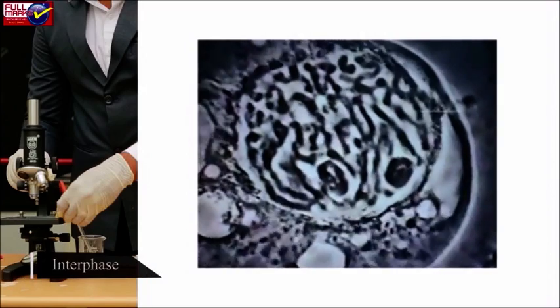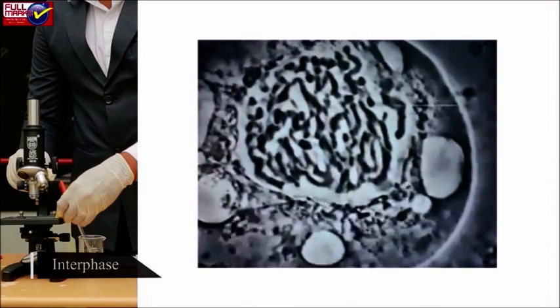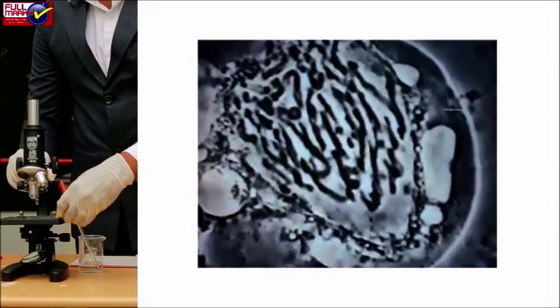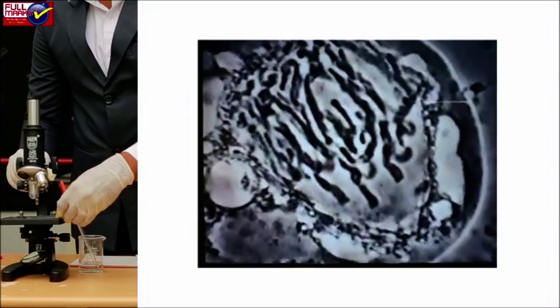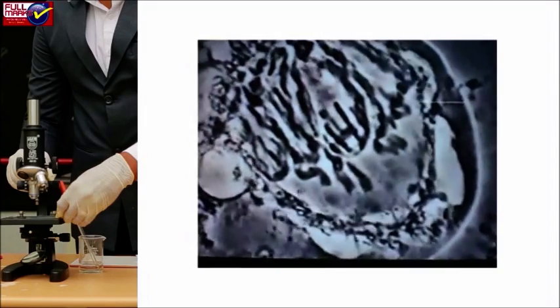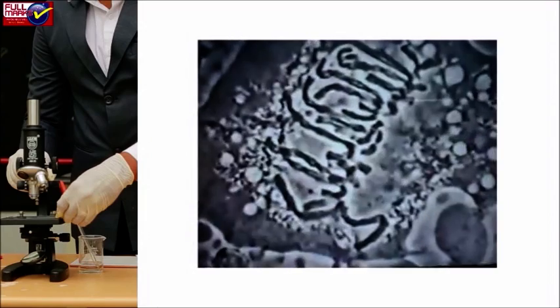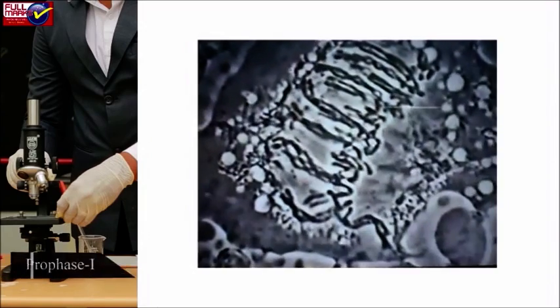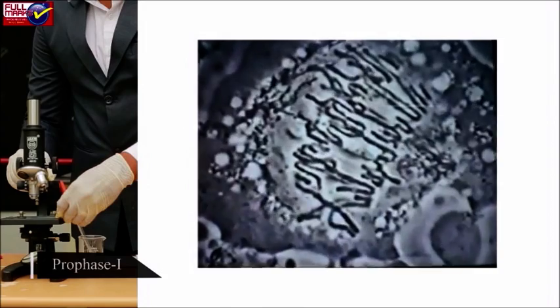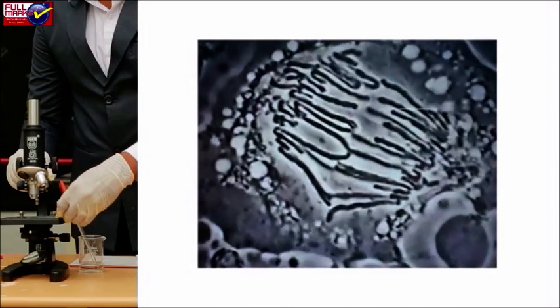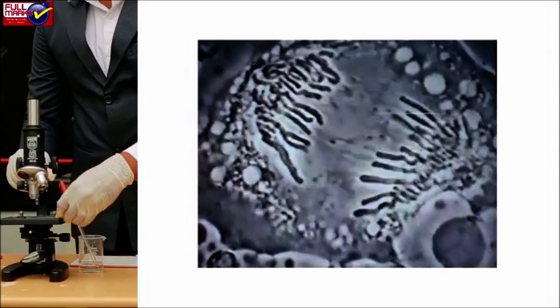Interphase: Before undergoing meiosis I, each cell will remain in an interphase during which the genetic material is duplicated due to active DNA replication. Prophase I: In the first meiotic division, reduction in chromosome number occurs without separation of chromatids. Prophase is the longest phase and has five stages.